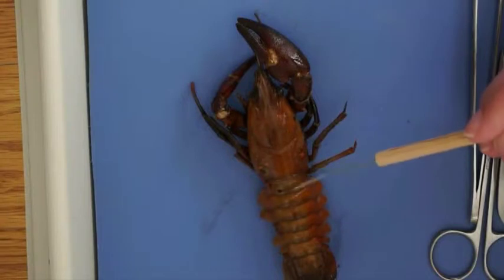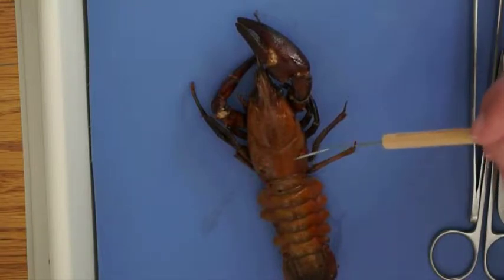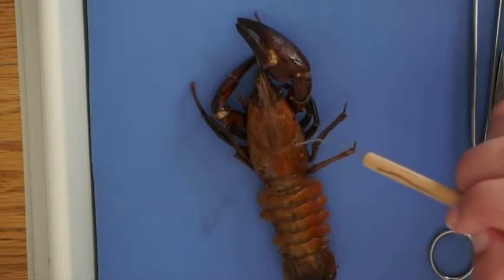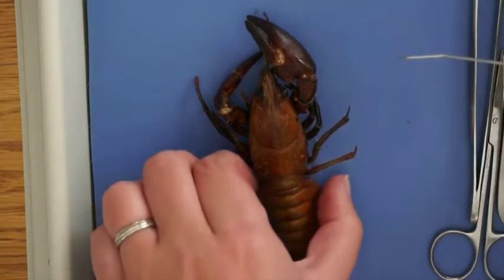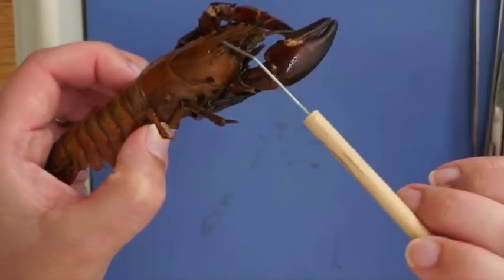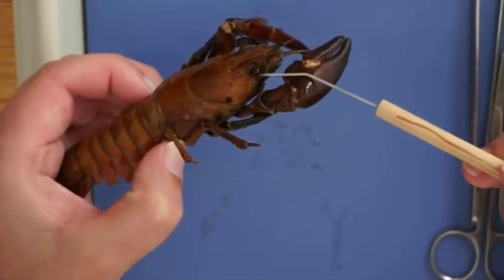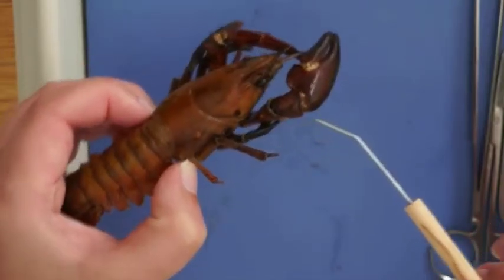First we're looking at the cephalothorax here, and that is the abdomen at the bottom. You can see that the carapace is that hard shell made of chitin. There is a cervical groove in between the head region and the thorax or chest region of the crayfish. Along in between the eyes is the rostrum — that's that hard protrusion of the carapace. And you can see those eyes on stalks, like a lot of arthropods.